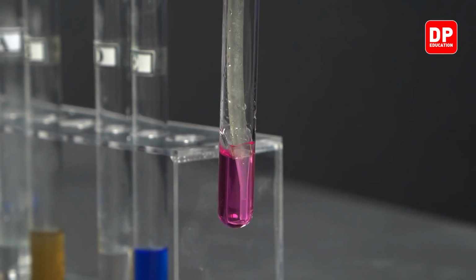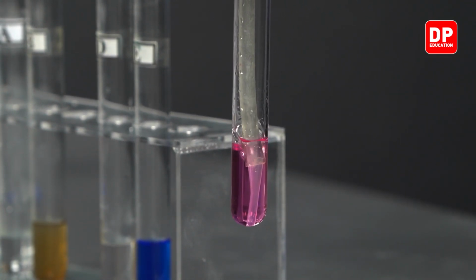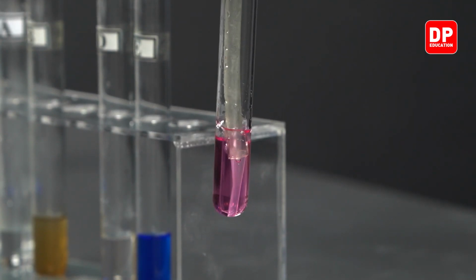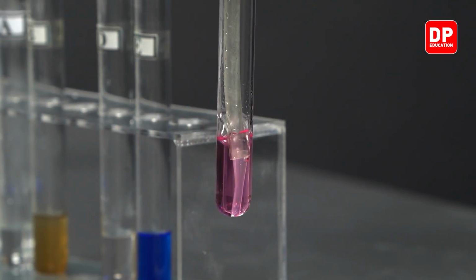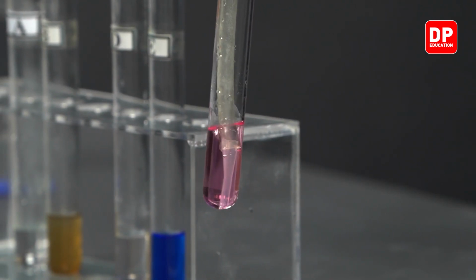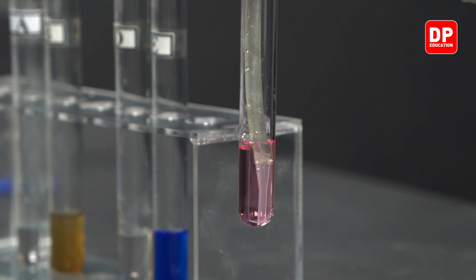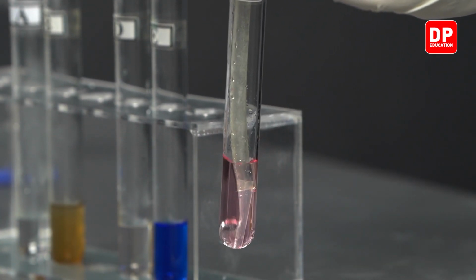As you can see, little by little, the color of the acidified potassium permanganate is decreasing. Acidified potassium permanganate is turning colorless little by little.